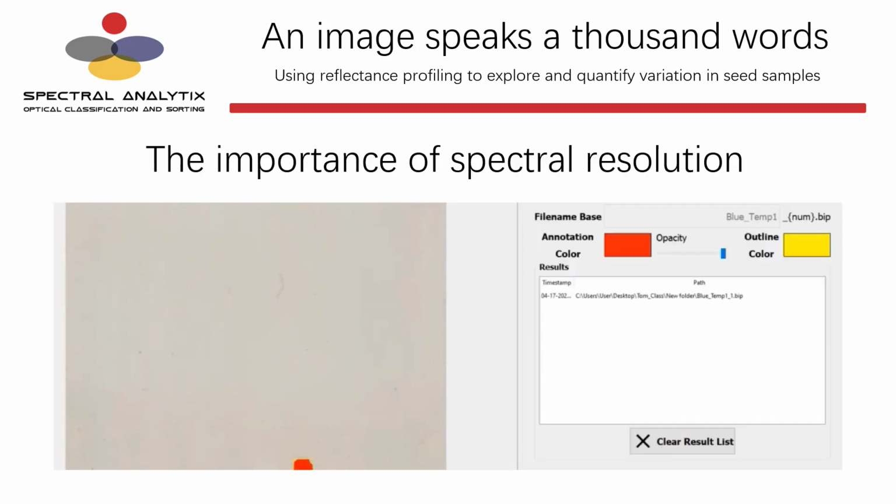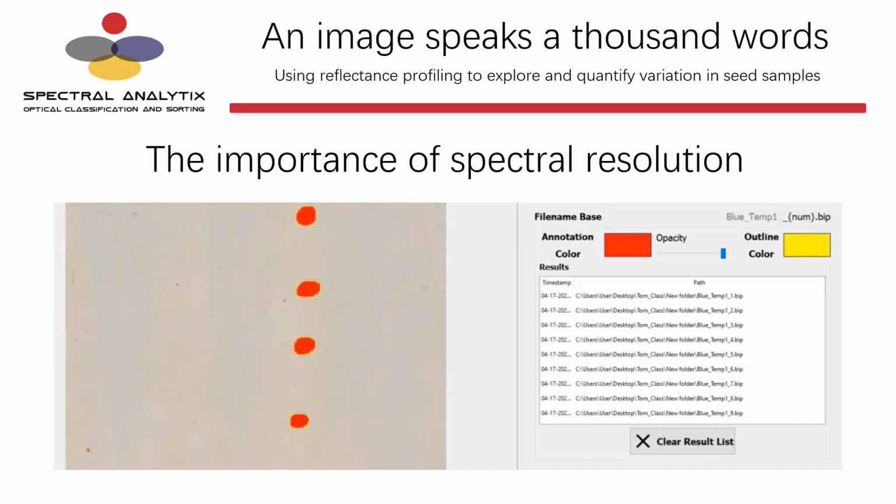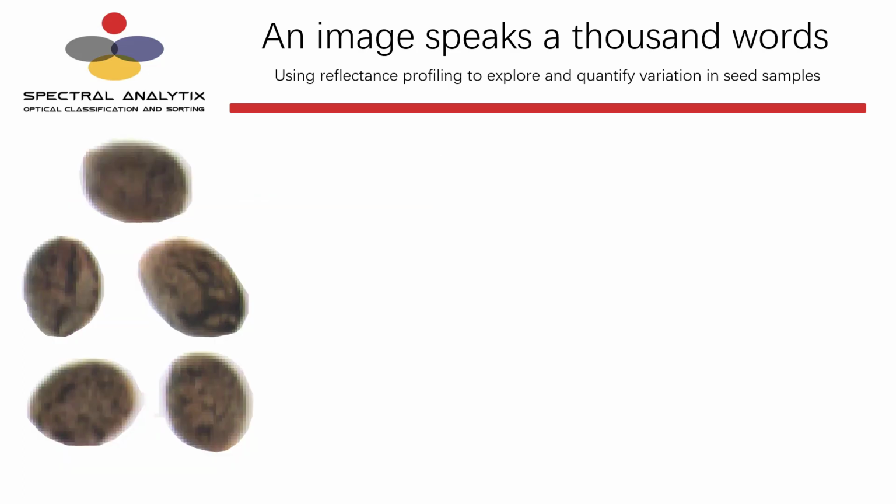If we look at some data, suppose we are placing seeds on a running conveyor belt and image them individually in a straight line. Imagine that each seed is captured as a single image with a serial code being associated with each image and the background being removed. For illustration of this, we're showing 5 hemp seeds acquired with our imaging system. And you can see that the 5 seeds are very, very difficult to tell apart.